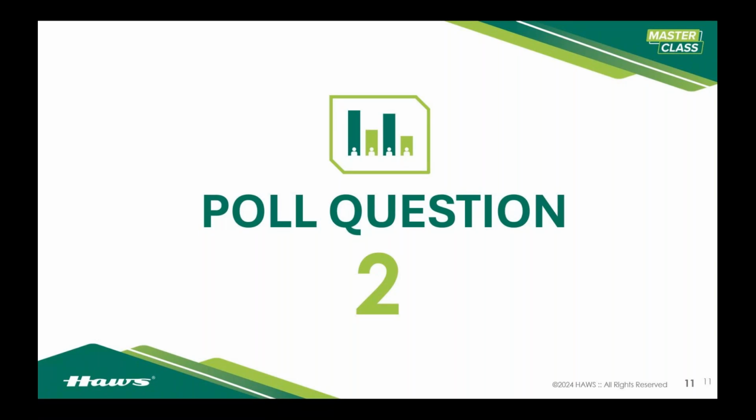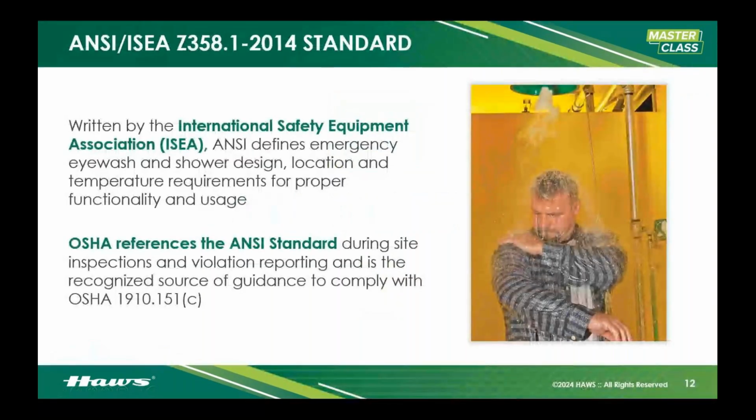Alrighty, it looks like the majority of you said the average OSHA fine is $11,000 to $25,000, and the second one was the $1,000 to $10,000. So thank you everyone for participating in this second poll question. Pretty spot on there. About 70% of you are participating there. Thank you very much. So yeah, slightly less likely that you're getting the big ticket item. The problem is when you have multiple fines that end up adding up, because you'll end up getting fined per incident, and that can be quite costly.